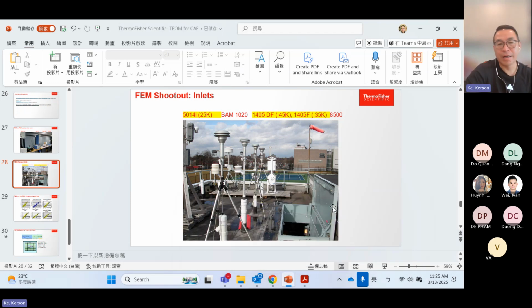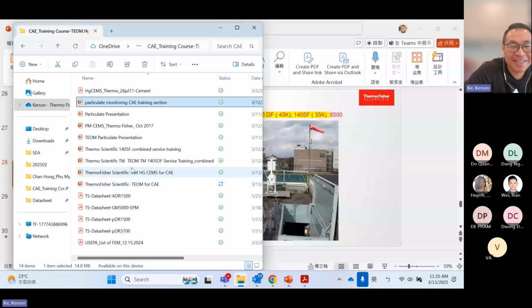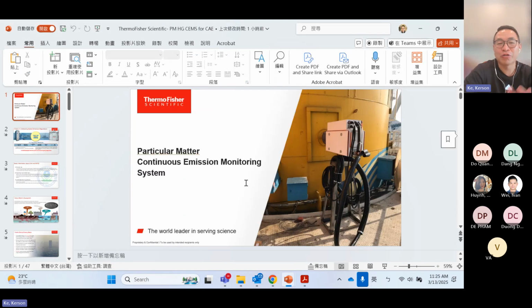Right. Any other questions? Actually, I don't. I prepared enough slides, but maybe at the next training I can share more, because in addition to this TEOM, we use TEOM technology in the stack, and stack monitoring is more related to industrial.